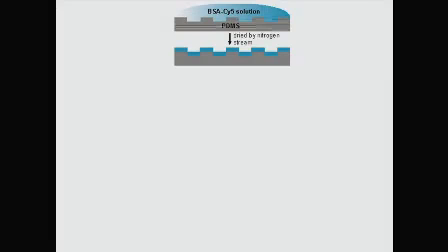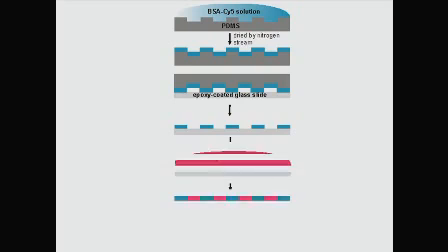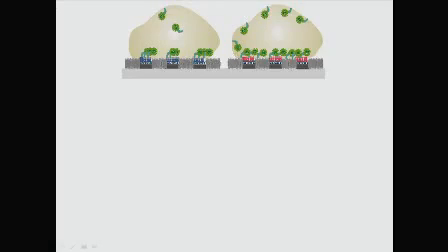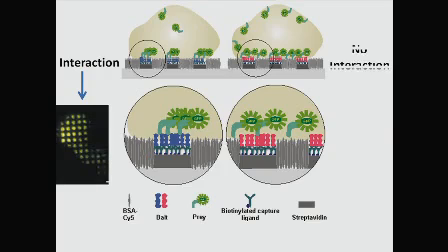Here is a schematic illustration of the micro-patterning assay. Grids of BSA Cy5 are printed on functionalized glass cover slips, and interspaces are filled with streptavidin, followed by biotinylated ligands, in most cases antibodies, against the membrane protein bait. In cells grown on such microbiochips, the bait will be arranged in the plasma membrane according to the antibody micropattern. Interactions with a second fluorescently labeled protein, prey, are probed by measuring the degree of co-patterning.